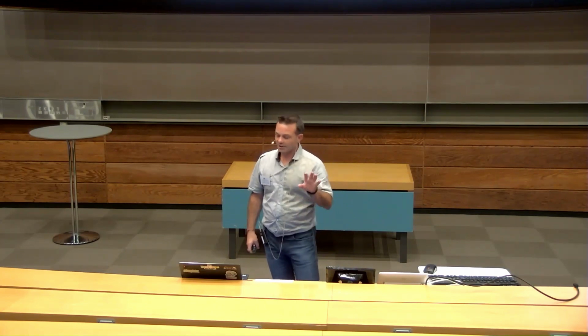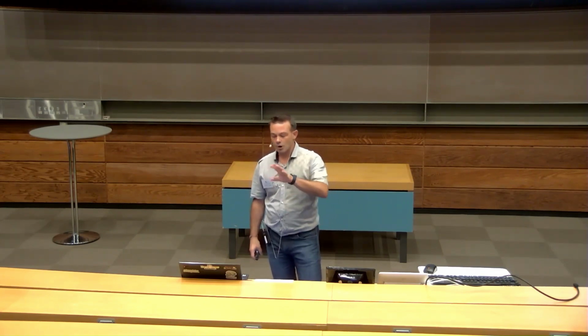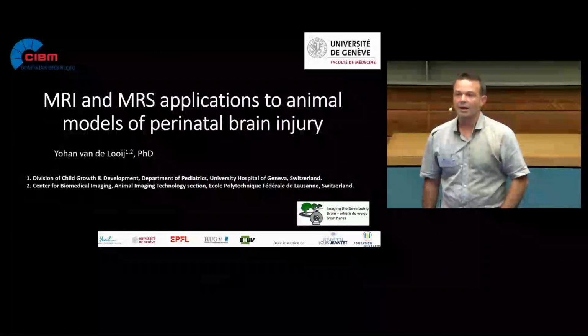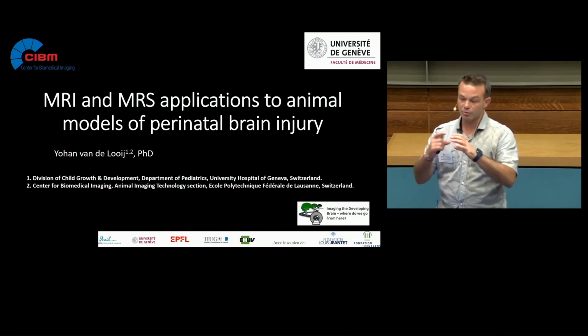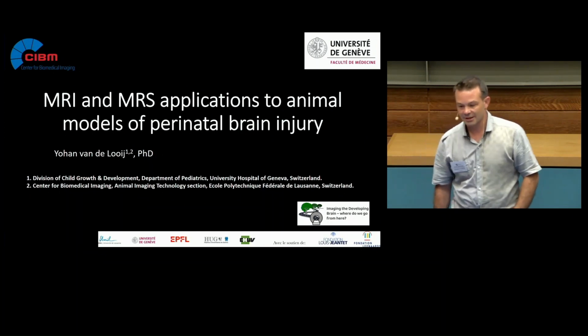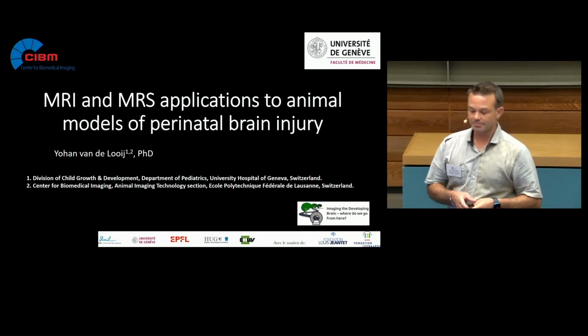So I'm working at the University of Geneva, division of child development, and I'm based in a laboratory in Lausanne, at EPFL, which is the CIBM, Center for Biomedical Imaging, where we are performing imaging on preclinical scanners, with small bore and mostly on rodents, using MRI and MRS, and mainly diffusion imaging.